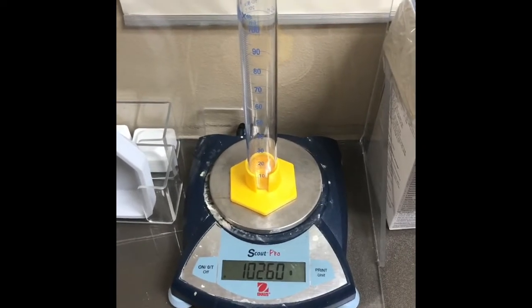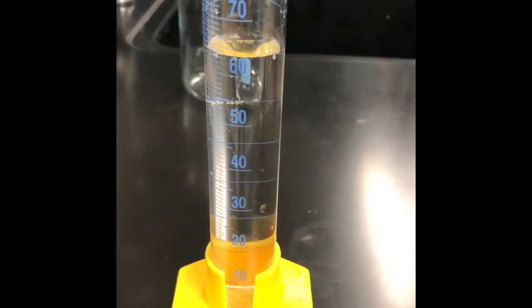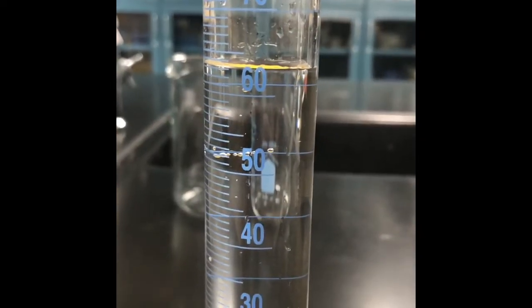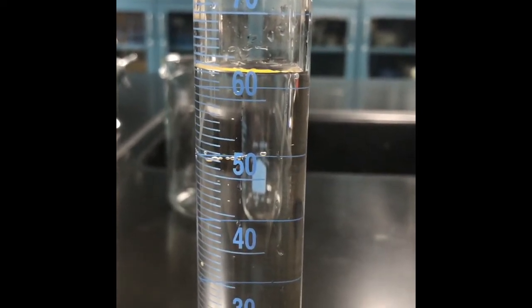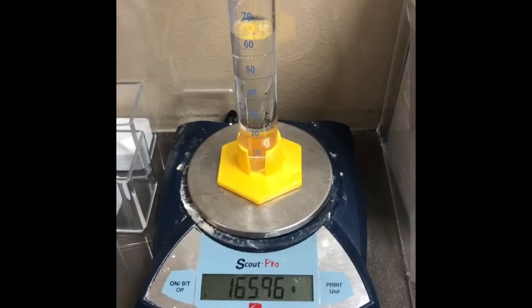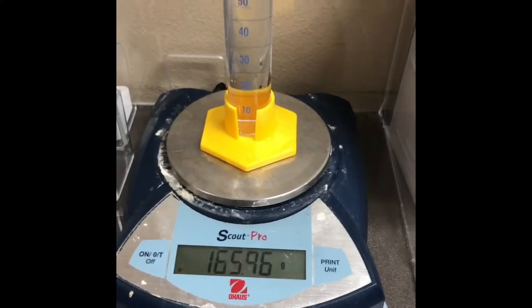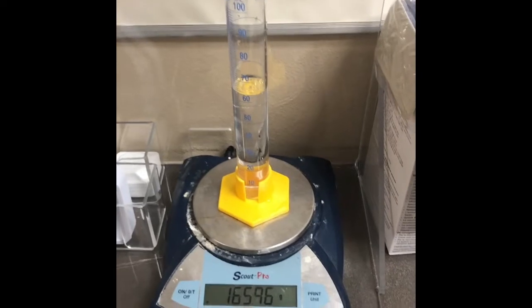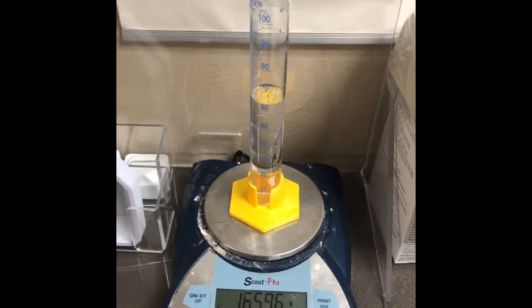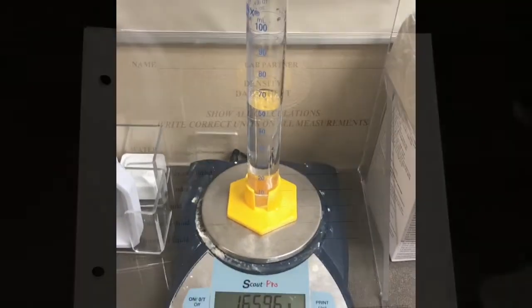It looks like it has a mass of 102.60. Now add between 60 and 70 milliliters of water, and as you can tell, we read from the bottom of the curved line called the meniscus, so we got about 63 milliliters of water. Next is to weigh the graduated cylinder with the water in it. Okay, so we get 165.96. Now, the way we get the mass of the water is we subtract 165.96 minus the initial mass of the graduated cylinder.